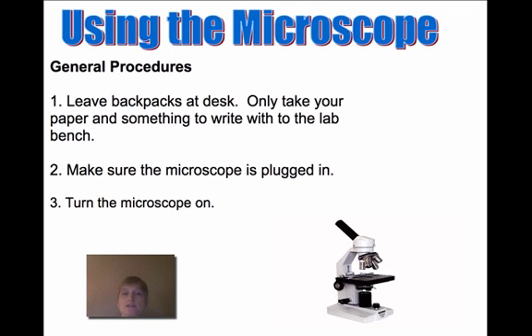All right, so when you go to use the microscope, I'm going to have you leave your backpacks at the desk. I only want you to take your paper and something to write with to the lab bench. You need to make sure the microscope is plugged in, and you also have to turn the microscope on.